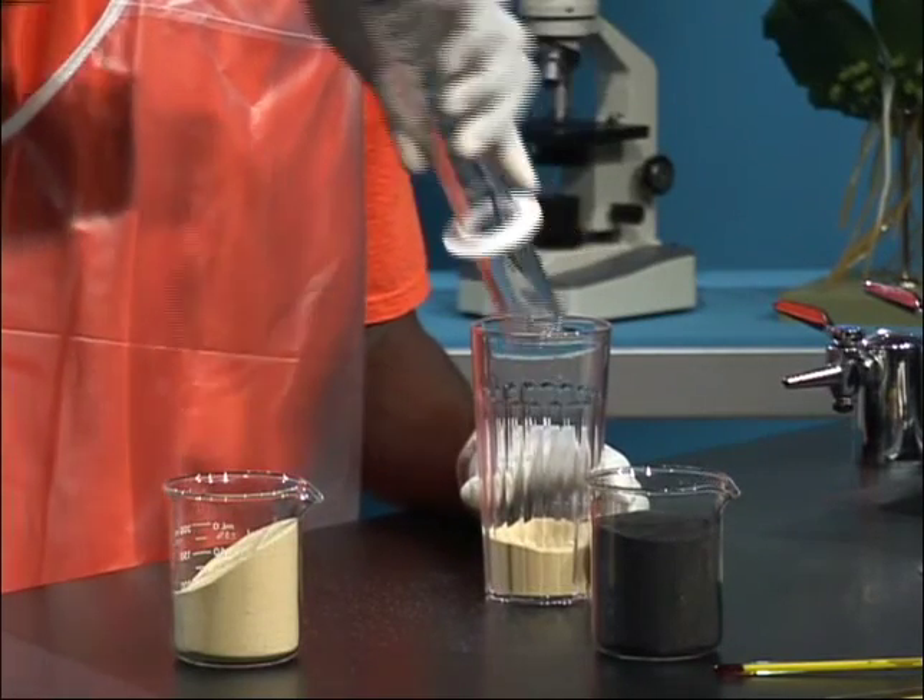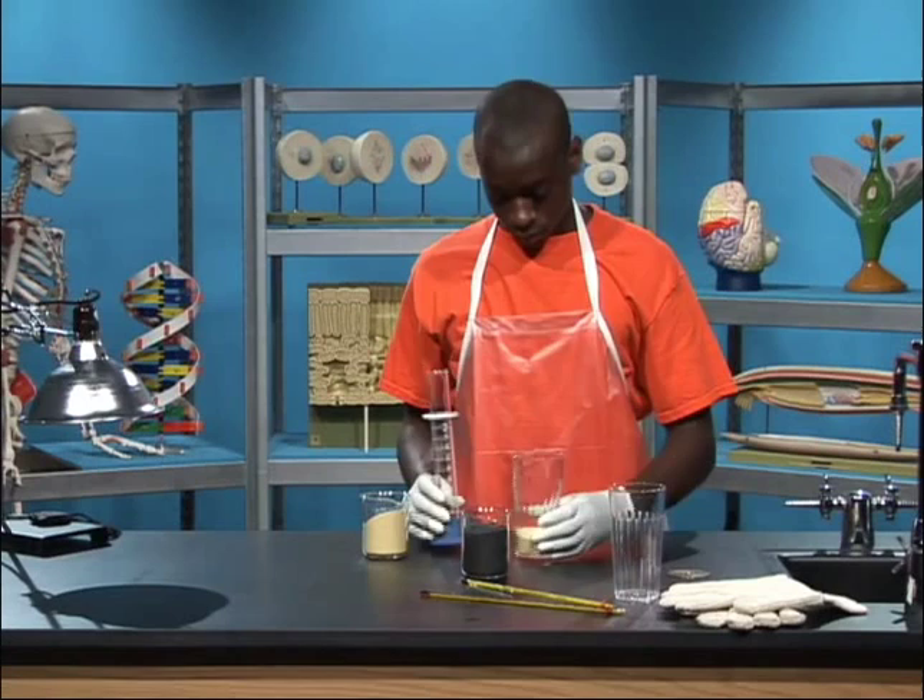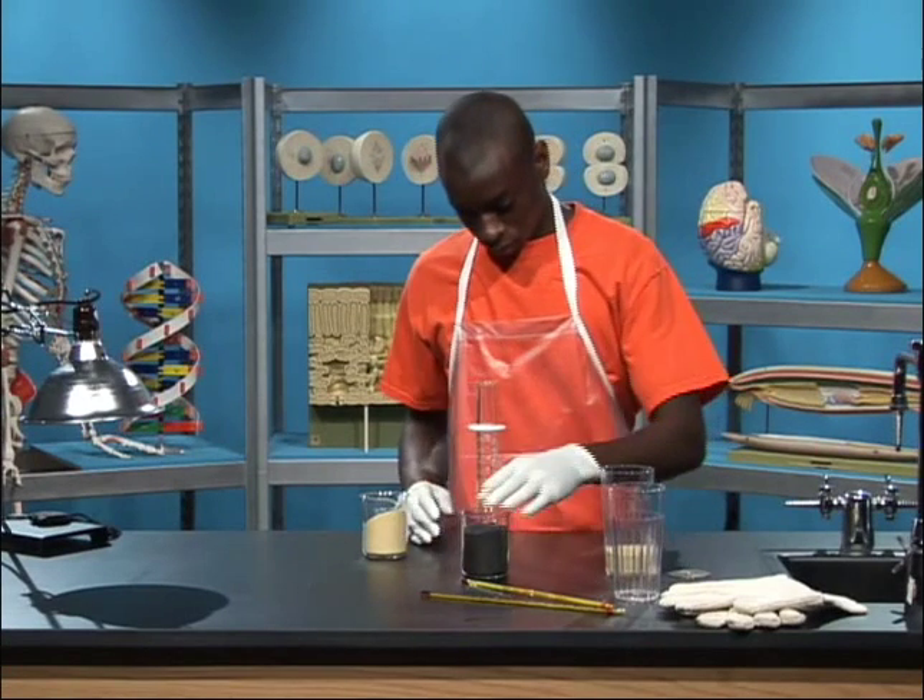Great! Now repeat the same procedure for measuring 75 milliliters of the dark-colored sand.